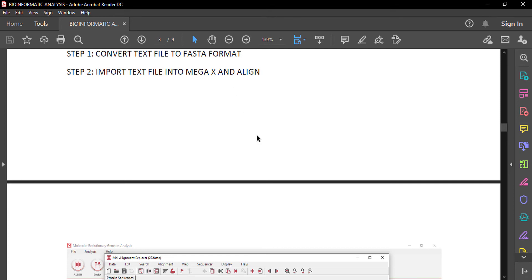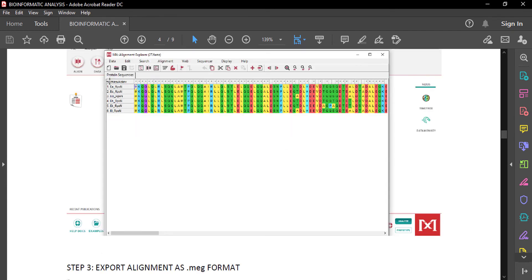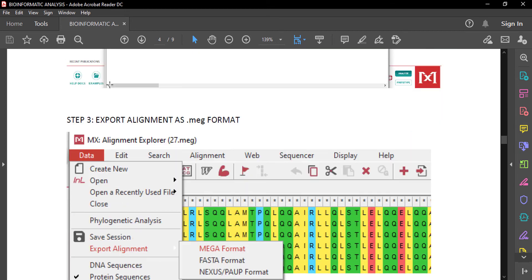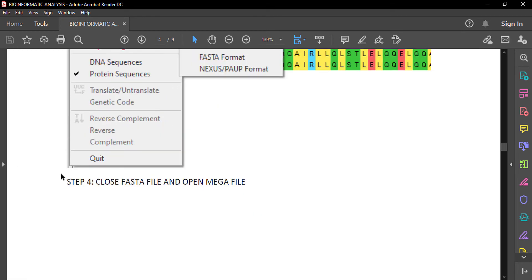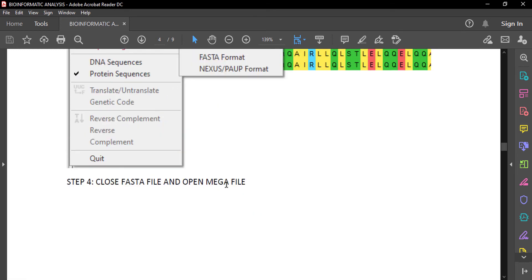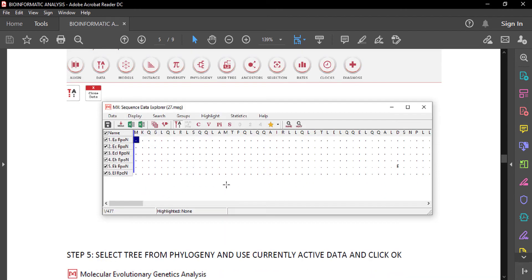Choose align. After the alignment file is generated, we have to go to data and export this alignment into .meg format, that is mega format. Then close the FASTA file and open the mega file. This is the mega file with the aligned result.